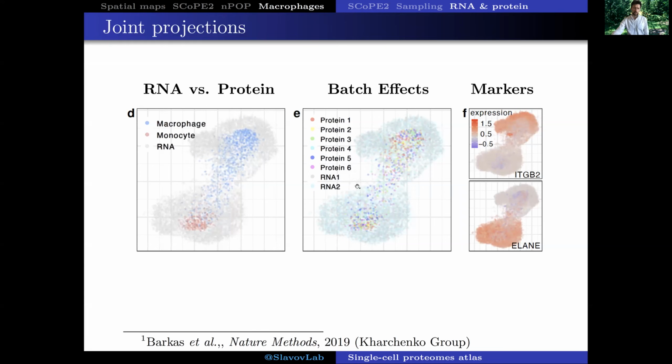We also wanted to evaluate the degree to which biases and artifacts contribute to this clustering. So we color-coded each cell based on the biological replicate and the technical replicate of the particular experiment, and we saw that there wasn't strong correlation between the coordinates of the cell and the replicates, suggesting that these biases are small and have been further reduced by the data analysis pipeline.